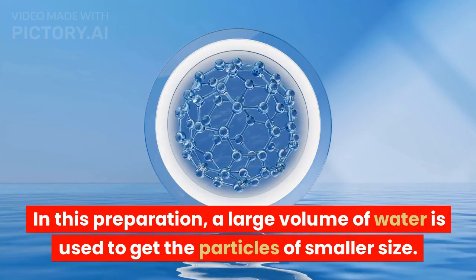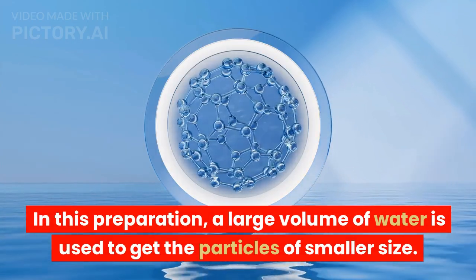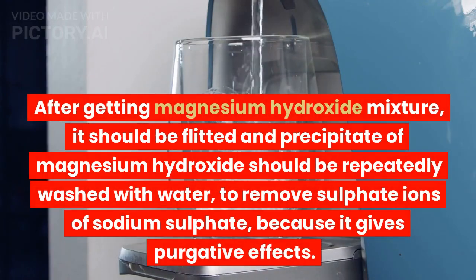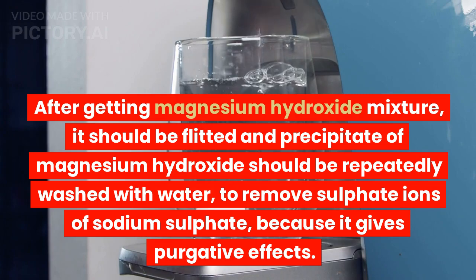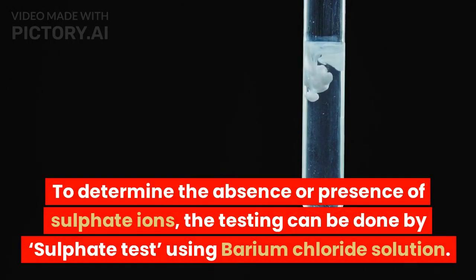In this preparation, a large volume of water is used to get particles of smaller size. After obtaining the magnesium hydroxide mixture, it should be filtered and the precipitate of magnesium hydroxide should be repeatedly washed with water to remove sulfate ions of sodium sulfate, because they give purgative effects. To determine the absence or presence of sulfate ions, testing can be done by the sulfate test using barium chloride solution.